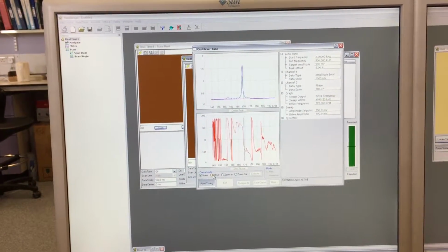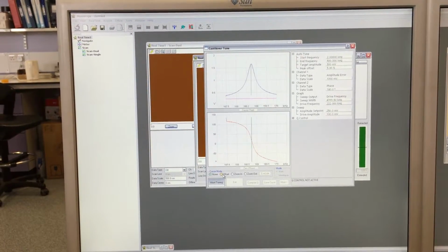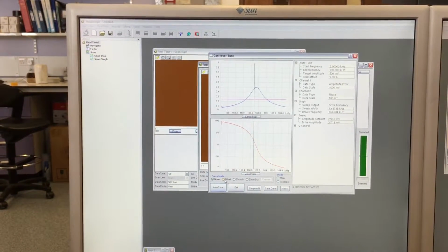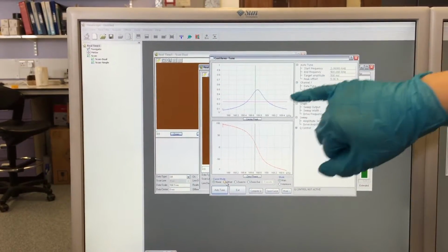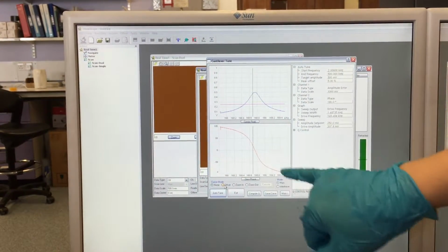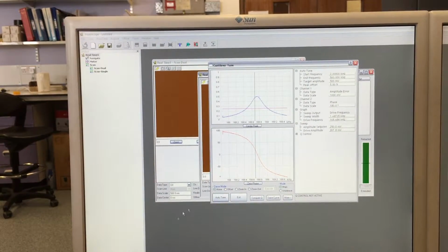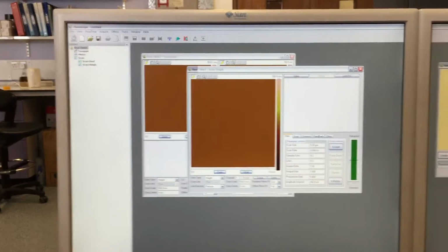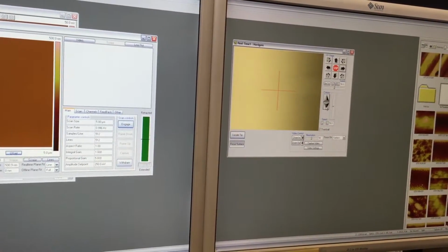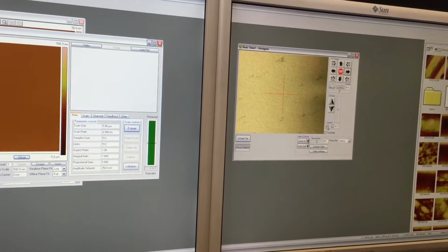But normally you would do it before even positioning the sample, is it? Do it after you find the crosshair and before you position on the sample, yes. The first graph, what you're looking for is close to where the peak is. And on the second graph is where the steepest slope is. So this is okay. And you go exit. And now I lower. I just have to do it slowly. Oops, I've gone over.